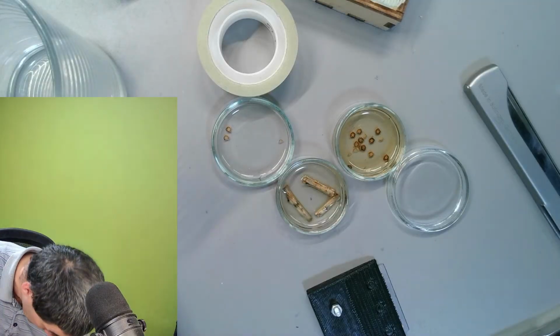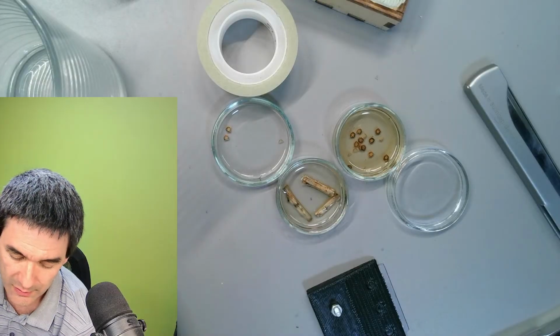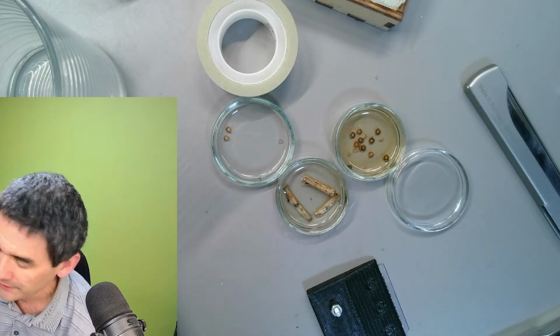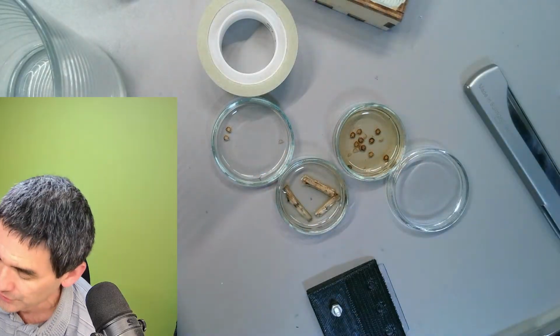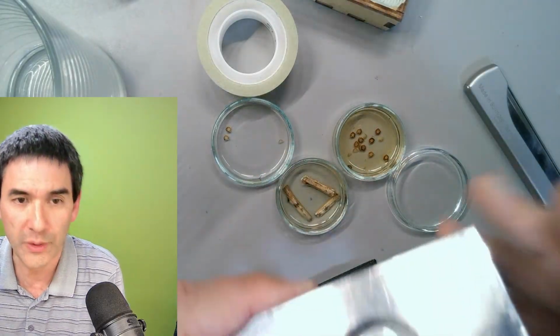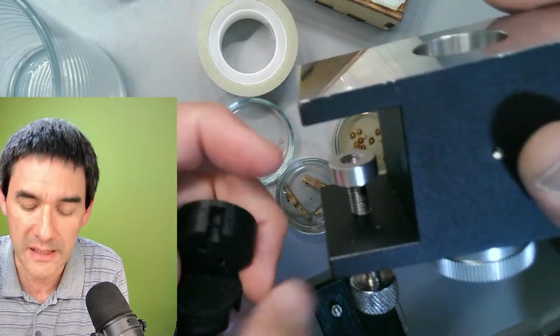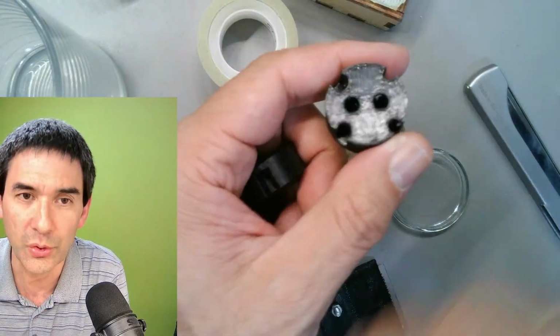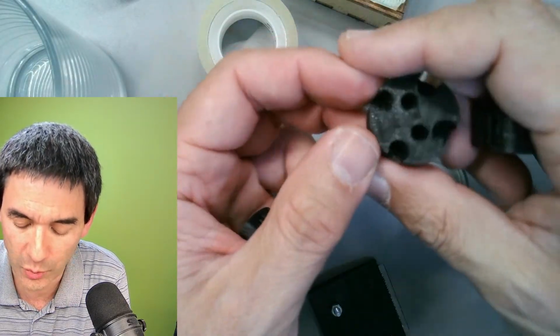And also from a previous video, I just also want to show you. I need to get them. Here it is. I think I'm not going to do that now, but I just want to put those here under the microscope first, to show you. What I've done is, because this has to be clamped into the table, and as we 3D printed those specimen holders, just want to show you quickly how this actually works.